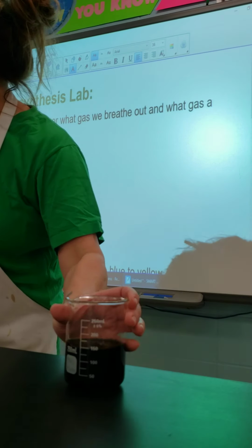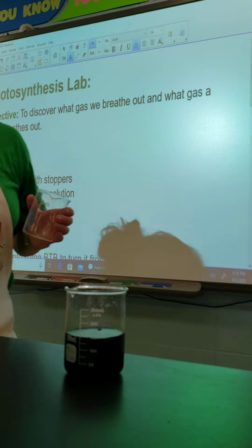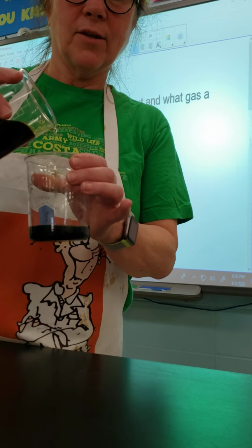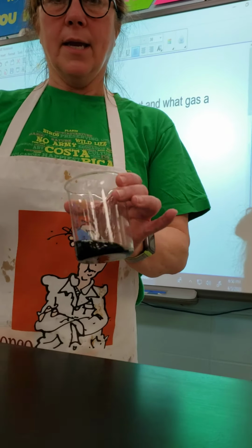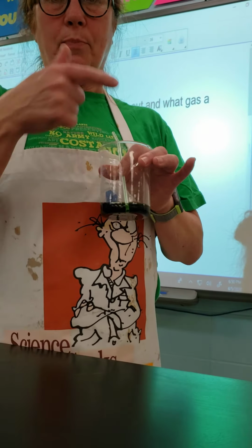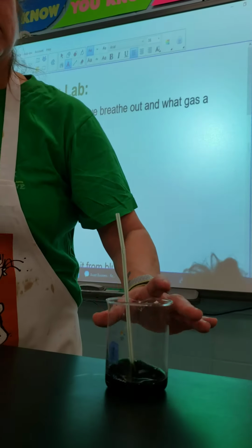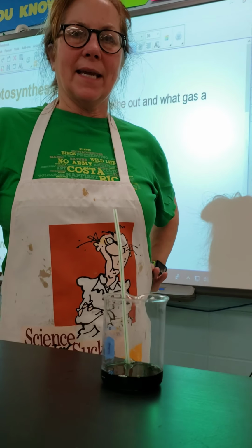Okay, now, if I take this BTB, so you can see it's green now, put it in a beaker, and then I'm going to take a straw and I'm going to blow into it. So what gas do we breathe out? First of all, let me explain what BTB is. BTB is an indicator.